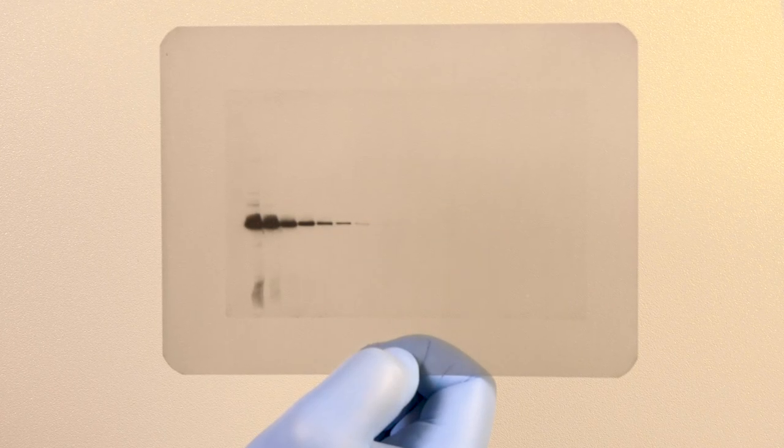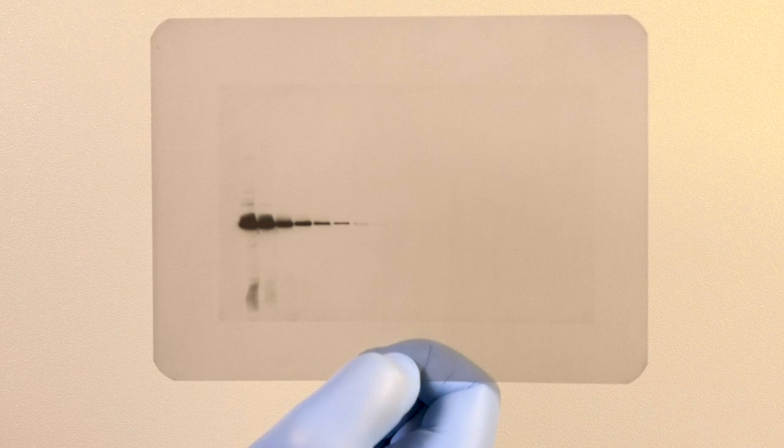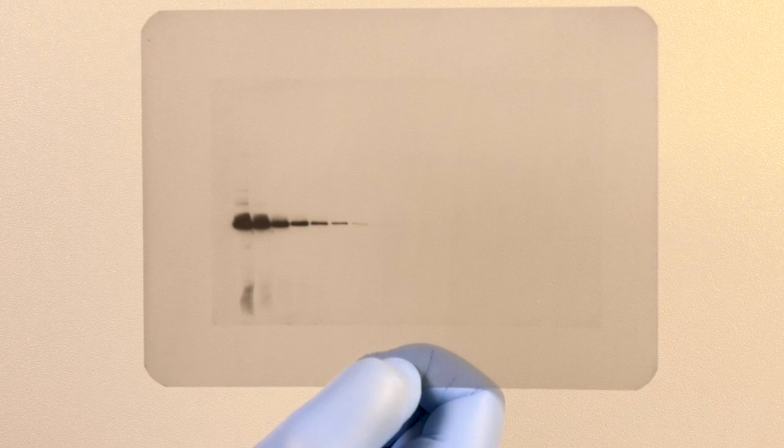The signal accumulation mode in ImageLab Touch software provides the most film-like experience and will make intuitive sense if you are transitioning from film to digital imaging. This mode produces a series of cumulative images of your blot and mimics taking several film images with increasing exposure time.